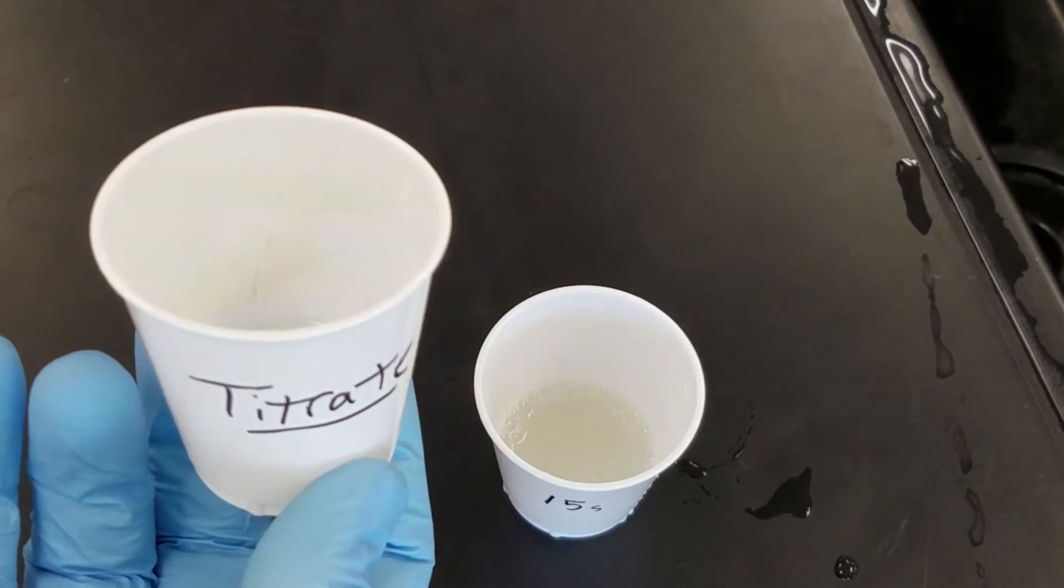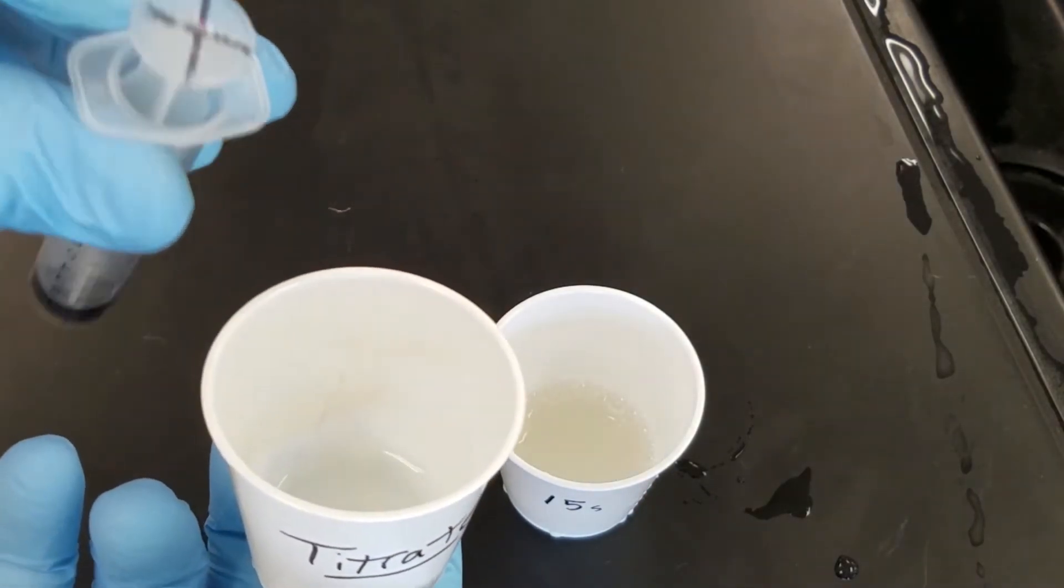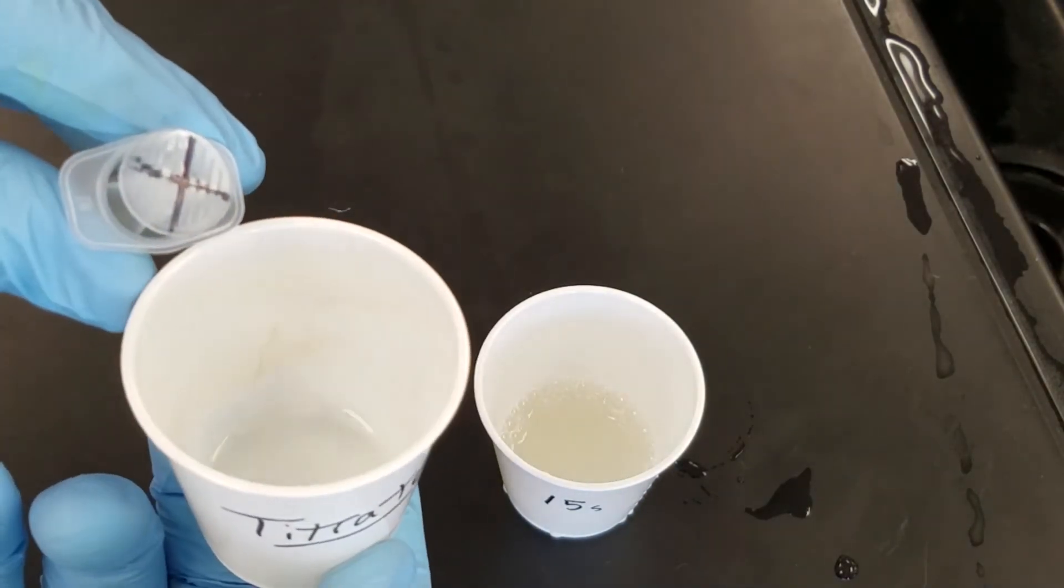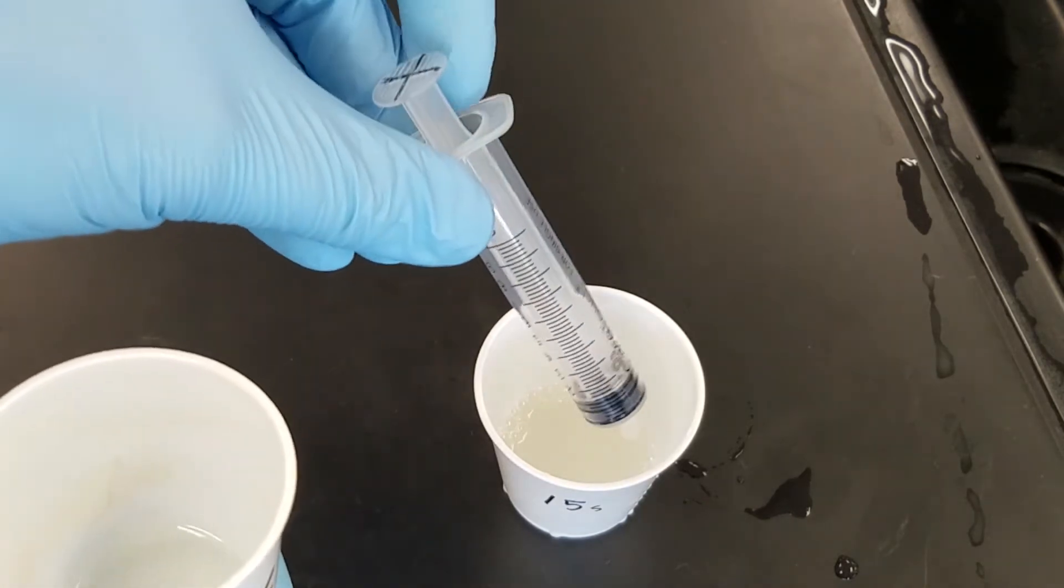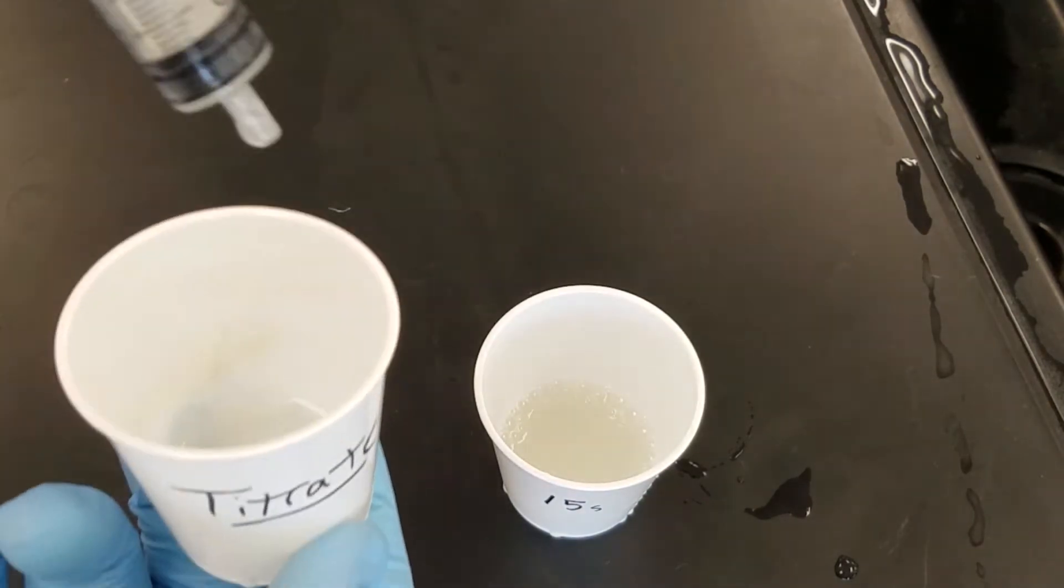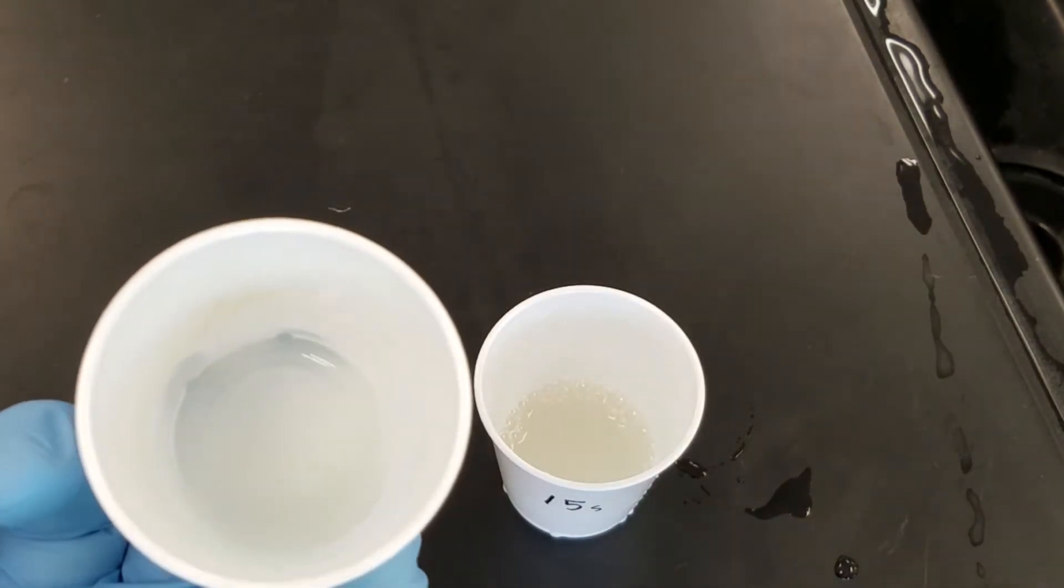To titrate, simply grab your titrate cup as well as your syringe that is meant to be the sampler and it has the X on it. You're going to suck out a total of 5 milliliters of the sample and put it in your titrate cup as I've already done here.